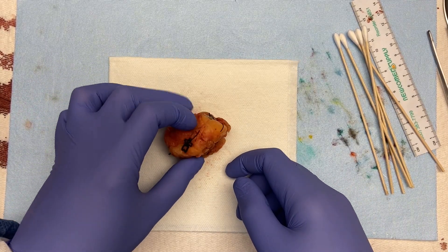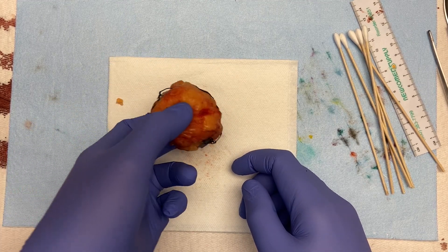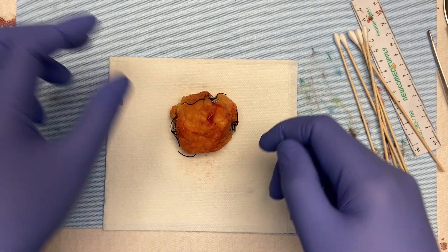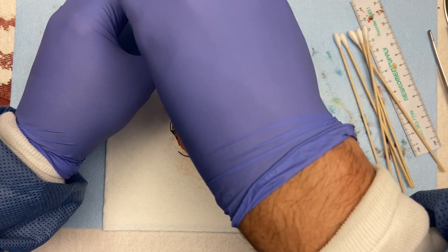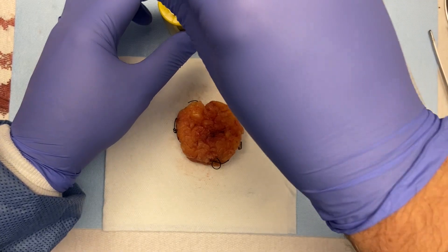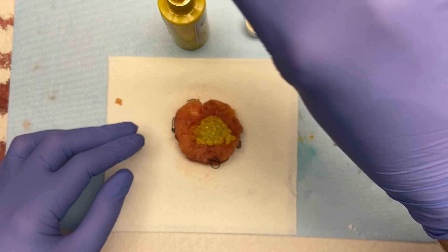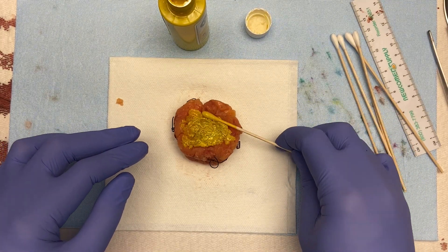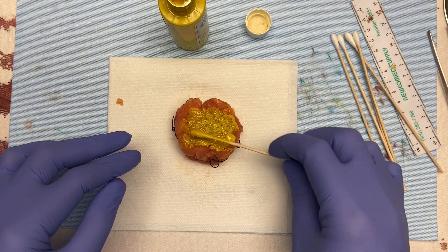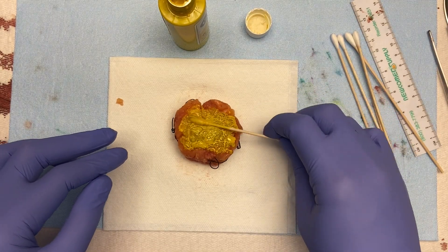We're ready to start inking now. I always ink in the same order: anterior, posterior, superior, inferior, medial, lateral. Our color code is: anterior yellow, posterior orange, superior black, inferior green, medial blue, and lateral red. I orient it the way it appears on me and ink accordingly.